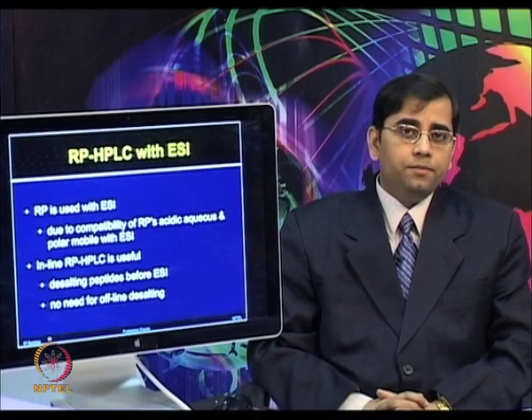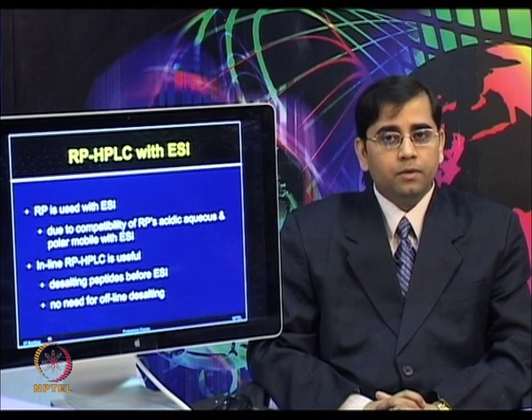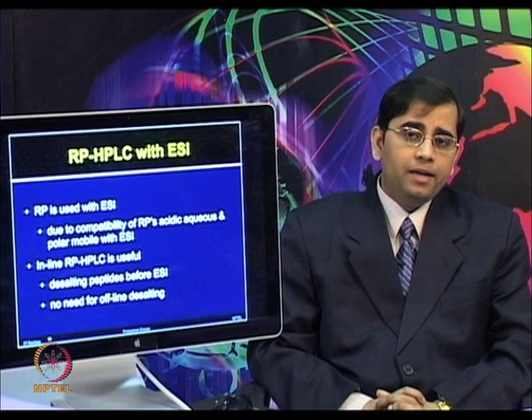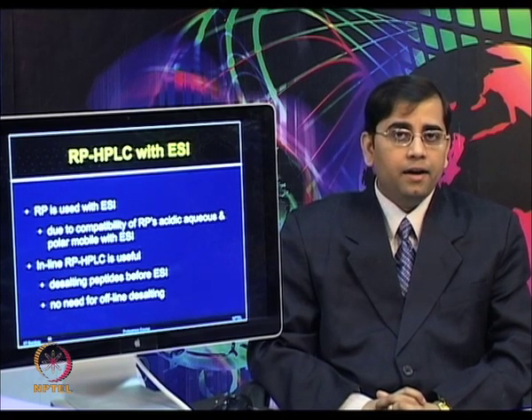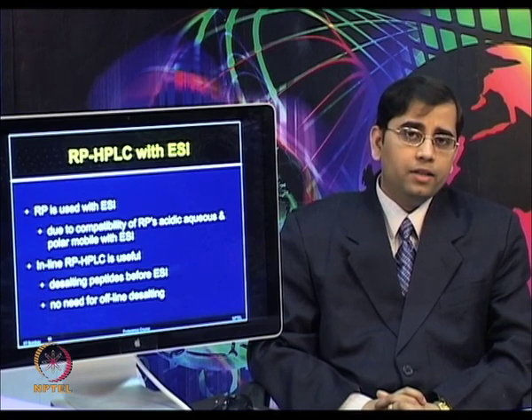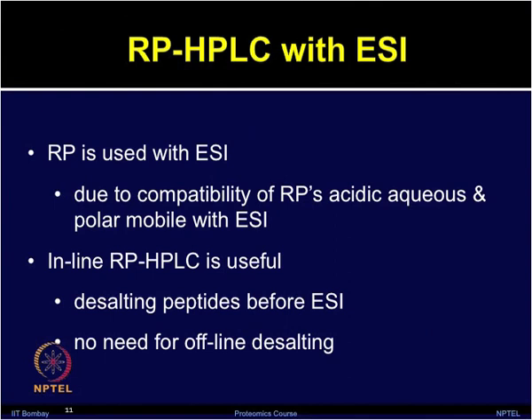Now, reverse phase is most commonly employed with electrospray ionization because of the compatibility of reverse phase acidic, aqueous and polar mobile phases with electrospray ionization. As I mentioned, in proteomics, one can use ESI and liquid chromatography inline. So, samples can be directly pre-fractionated and further analyzed using mass spec.